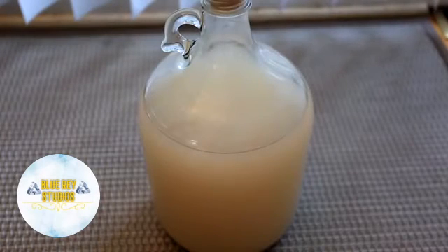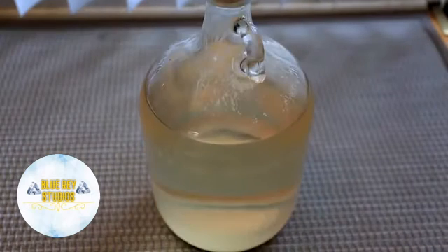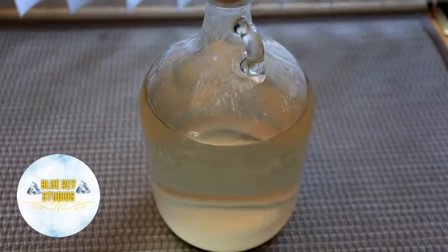After a few weeks, this is what your solution might look like. There's a lot of yeast in suspension, but this is perfectly fine if you plan to distill it. Optionally, you can add a clearing agent and wait a day or two, and your wash might look like this afterwards, much clearer. If you plan to drink your wash, you can add some activated charcoal to clean it up, but I don't think it's going to taste very good either way.